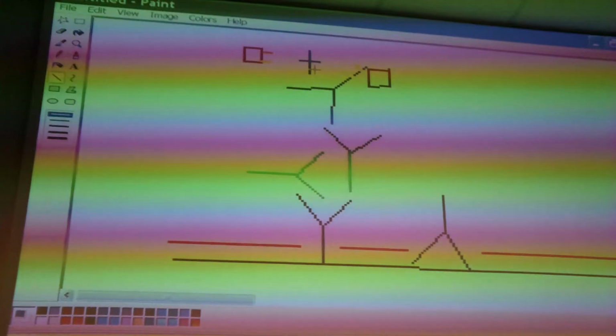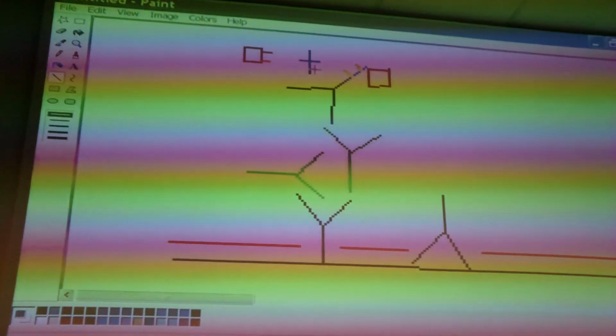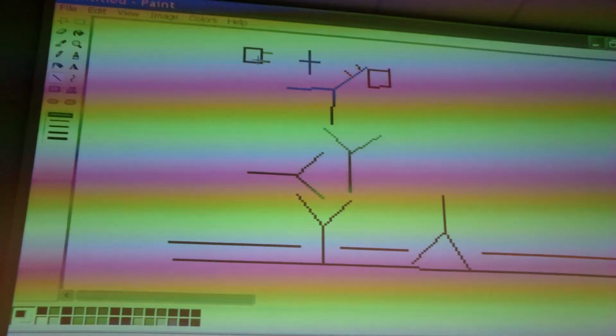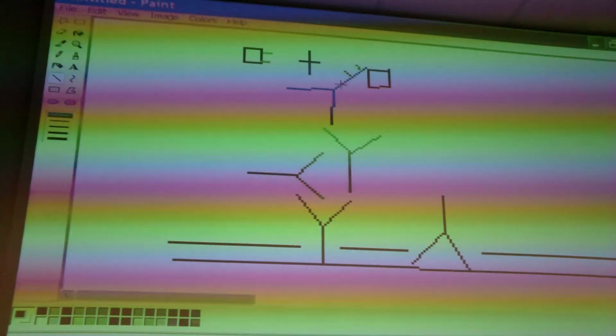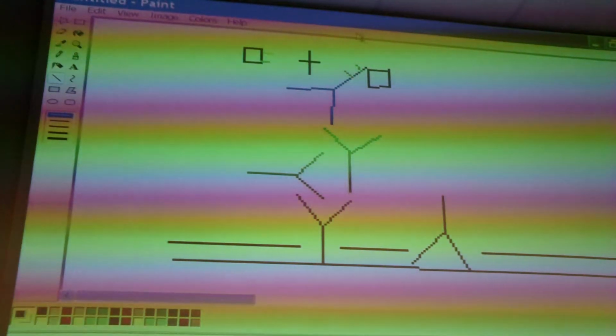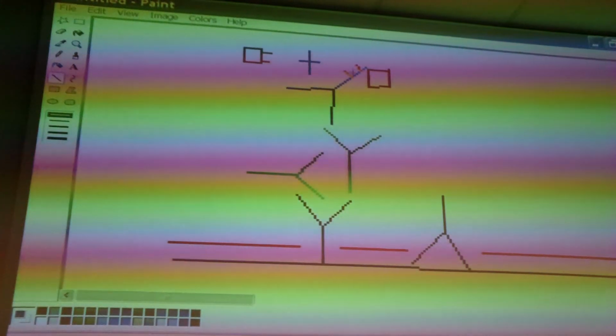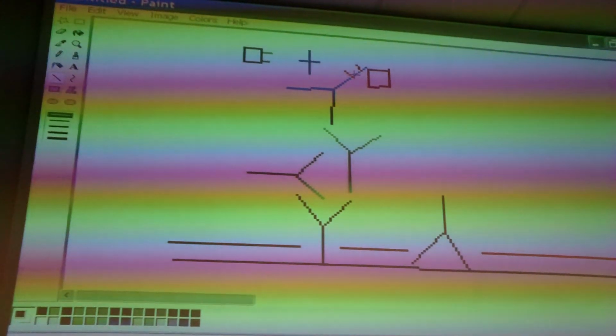I'm not going to be able to put it all together now to move it, but the streptavidin has 4 biotin binding sites. So the streptavidin has the property that it can cross-link the peroxidase that is biotinylated with an antibody that is biotinylated. So if you mix these 3 things together, the peroxidase with biotin, the streptavidin, and the antibody with biotin, then this will form a complex.